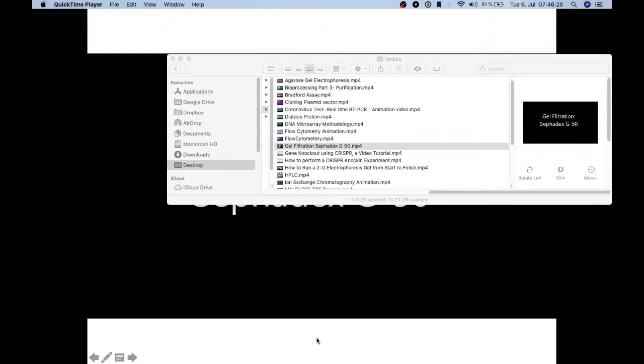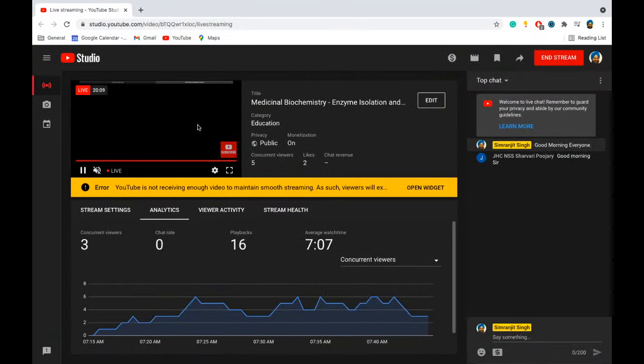So that was the gel exclusion chromatography. We'll share these videos and presentations after the lecture is over, because if I started to share now, they will not work out.